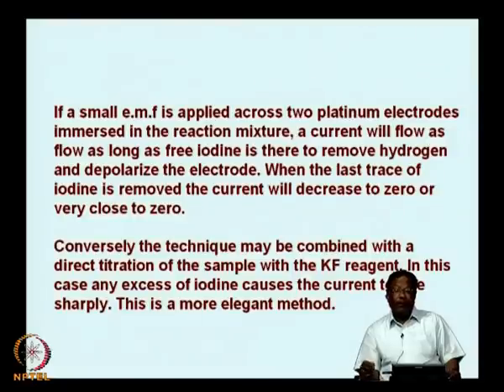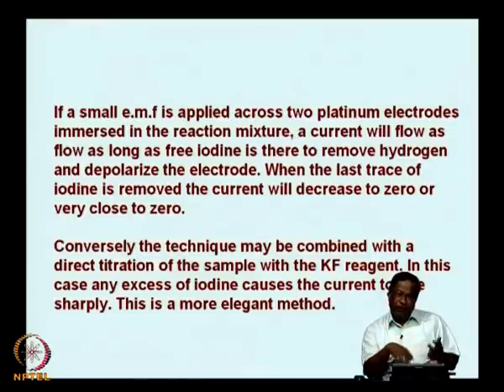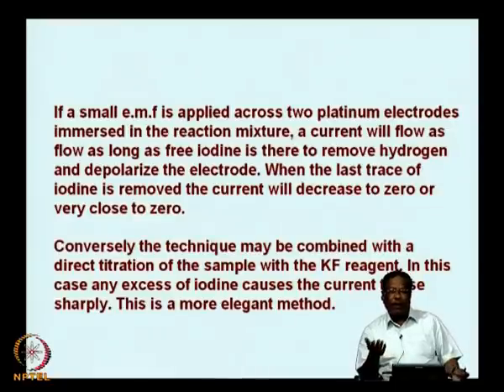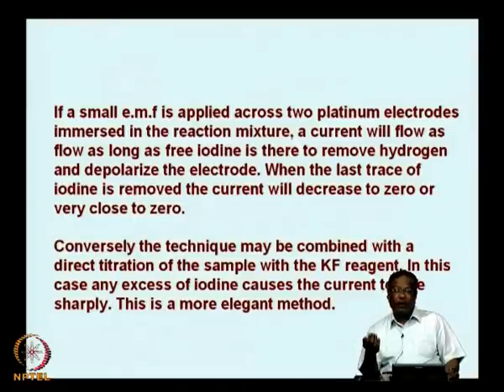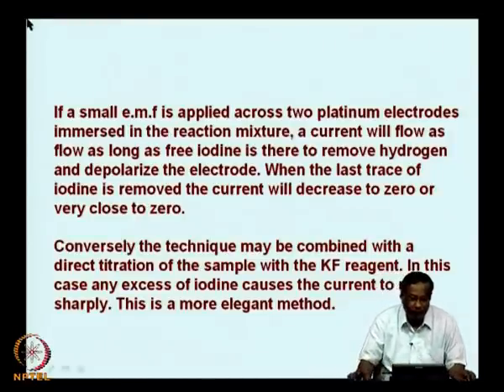Conversely, the technique may be combined with a direct titration of the sample with the Karl Fischer reagent. In this case, any excess of iodine causes the current to rise sharply. Either you can take it in the beaker or in the burette. So, you can do either way, add excess and then titrate, or you can straight away titrate the substance with the Karl Fischer reagent, and any excess of iodine causes the current to rise sharply if you are adding Karl Fischer reagent extra. So, either way it is a dead stop reaction.